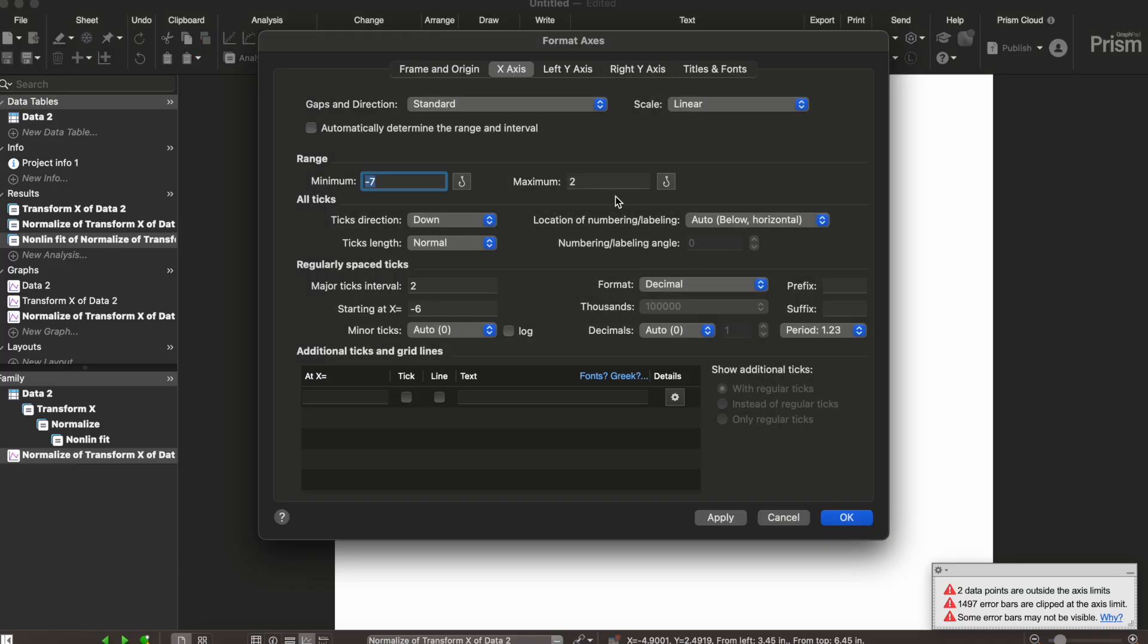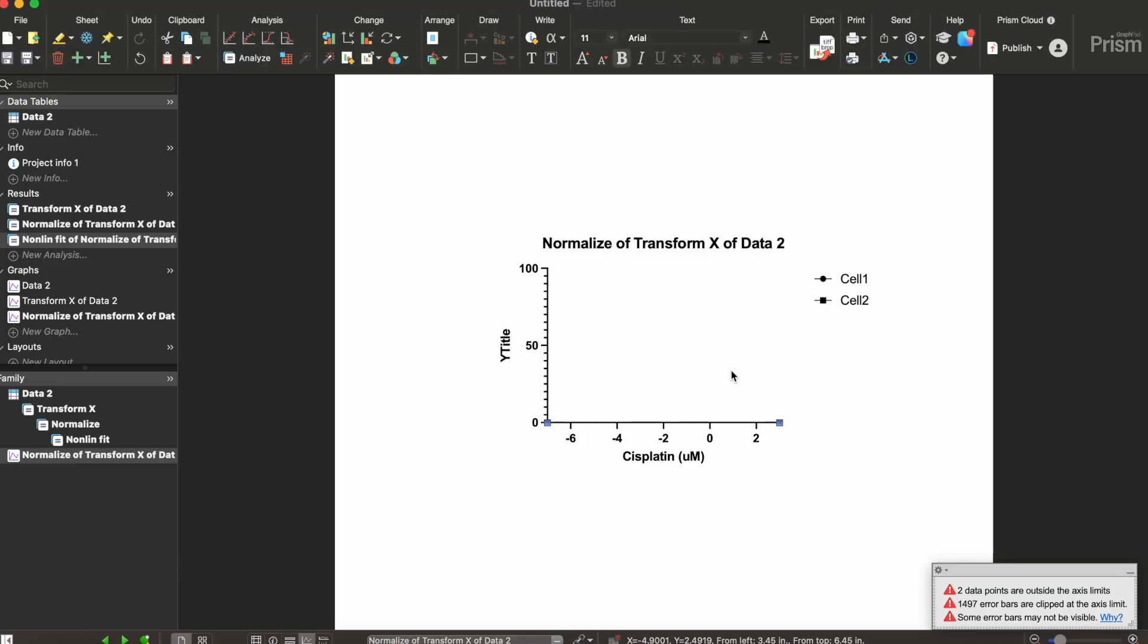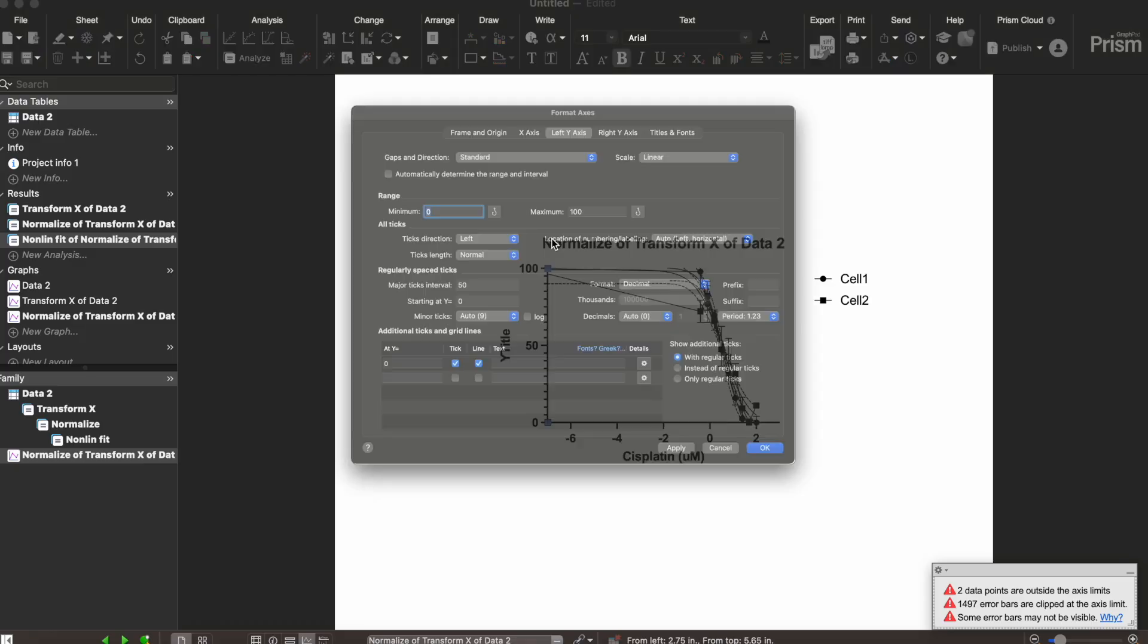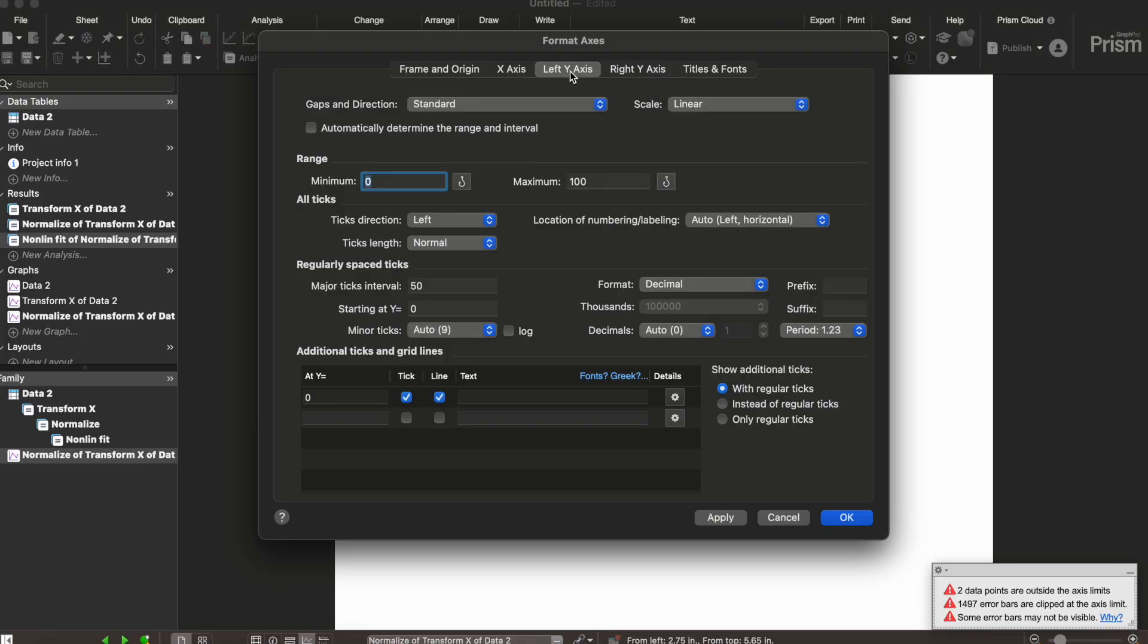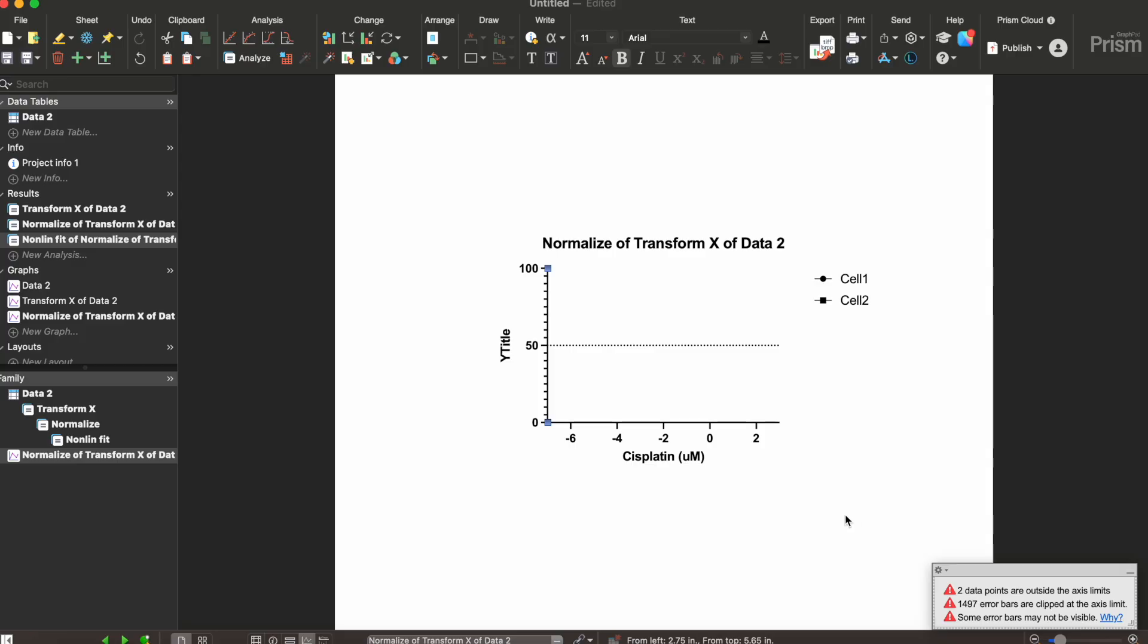Let's adjust the x-axis a little bit more. We'll try 3. Now we're going to go here to the left axis and we're actually gonna add a tick line. Let's do 50% because we're looking at the IC50. There. Perfect.